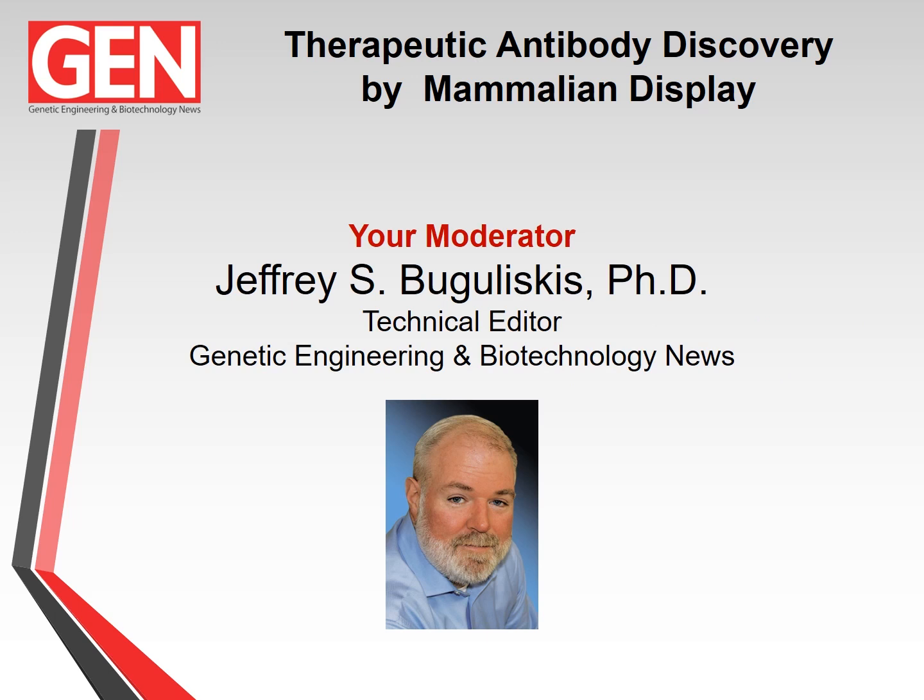Accelerating the drug discovery process, especially for biologics, not only helps companies get potentially life-saving therapies to market faster while increasing their revenue, it can also be a major boon for researchers, acting as the impetus for innovation. For instance, the use of gene editing technology has allowed for the direct integration of antibody genes and creation of mammalian cell libraries, leading to single antibody per cell constructs. Consequently, this has enabled the construction of libraries containing millions of stable cell lines displaying monoclonal IgG formatted antibodies on their surface, from which novel high-affinity binders can be isolated and in turn fast-tracking the drug discovery pipeline.